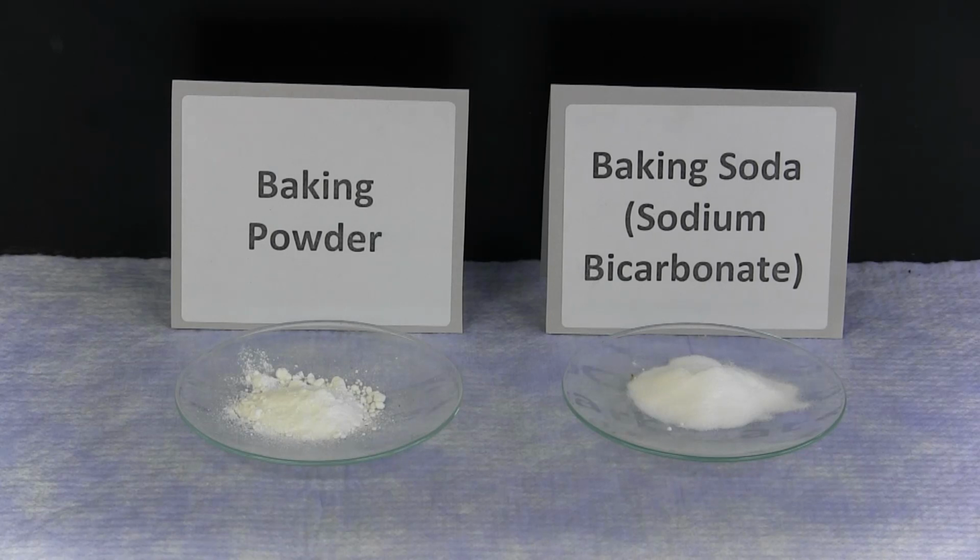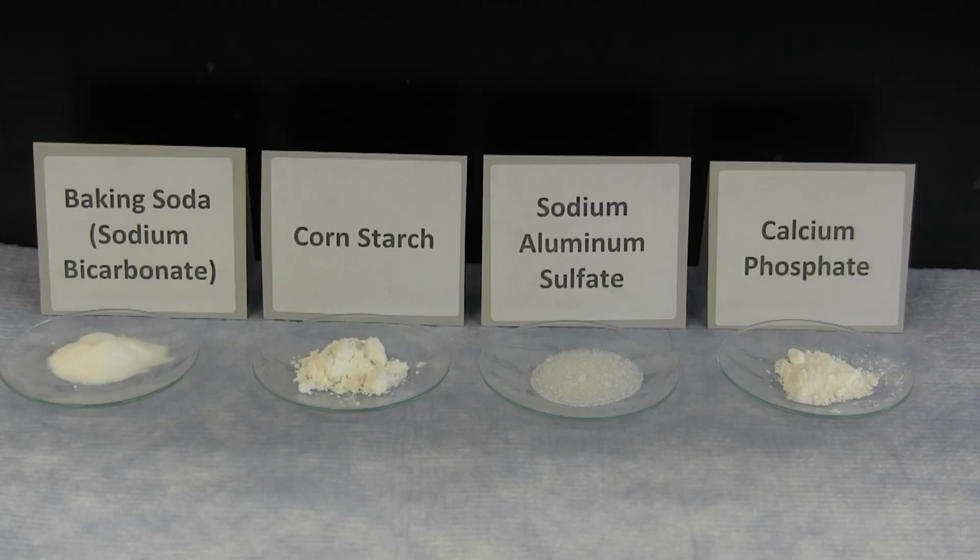Baking soda and baking powder are both white powders that are used in baking. While baking soda is a pure compound of sodium bicarbonate, baking powder, however, is a blend of 4 different components. The 4 components that make up baking powder are baking soda or sodium bicarbonate, cornstarch, sodium aluminum sulfate, and calcium phosphate. All 4 of these components are white powders, and when blended together, they comprise baking powder.